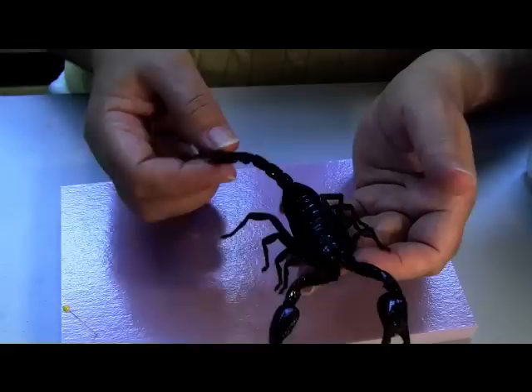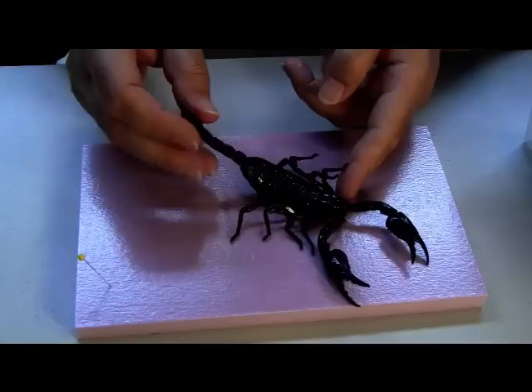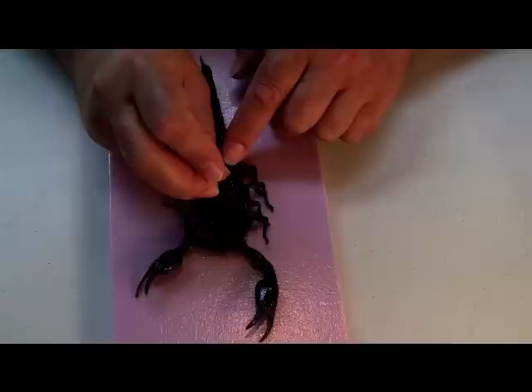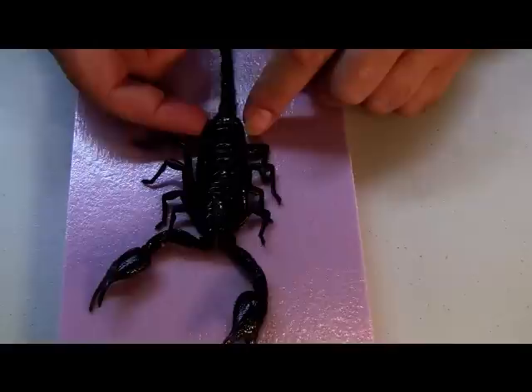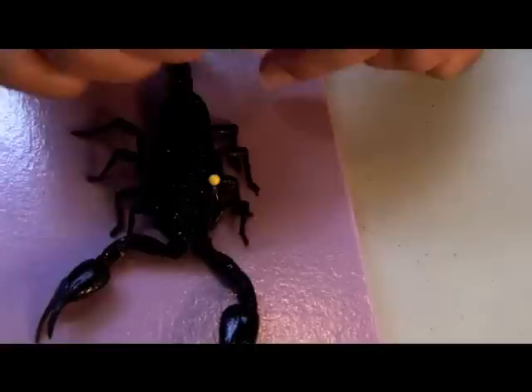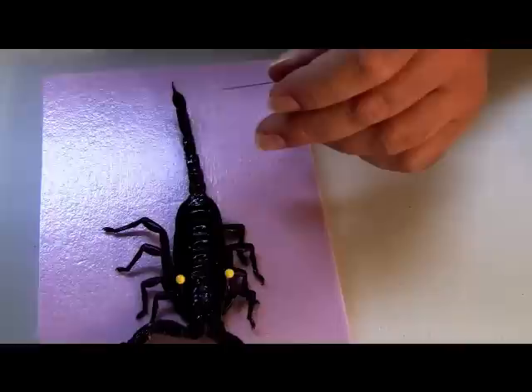Don't worry about his stinger because it is no longer poisonous. You're going to put him on a piece of Styrofoam and start spreading. Take your number three pin, heavy black, and pin through him just to hold him there. He'll pivot, so you're going to start pinning him on either side to keep him from pivoting. Now he can't move much.